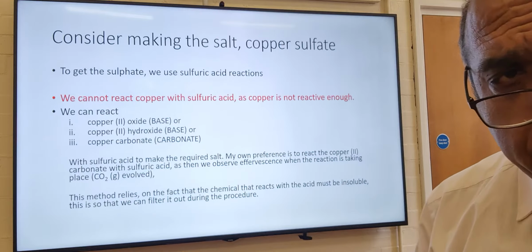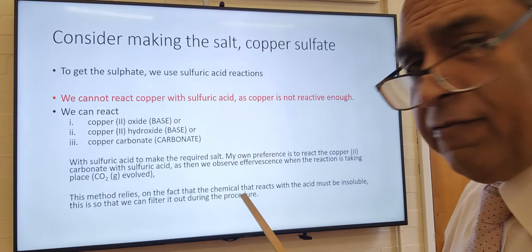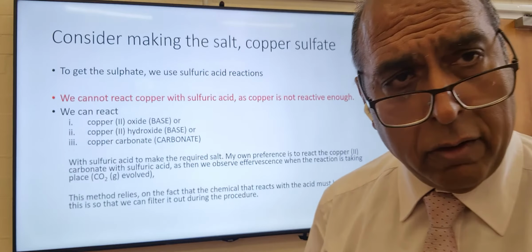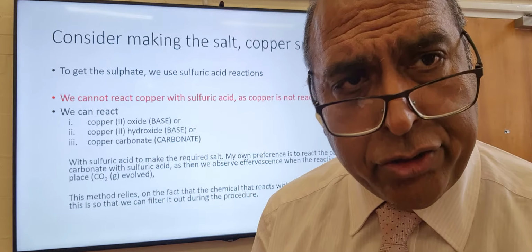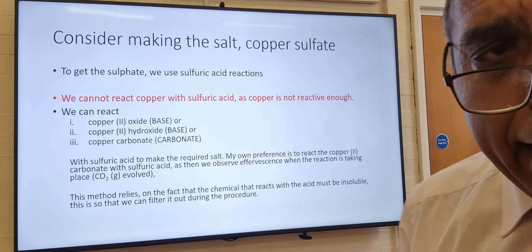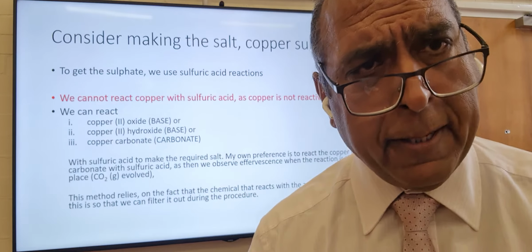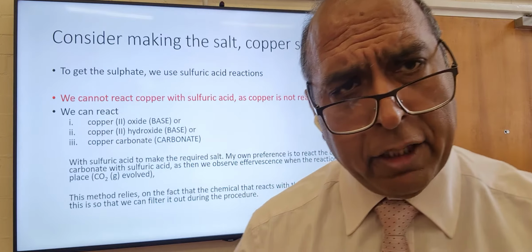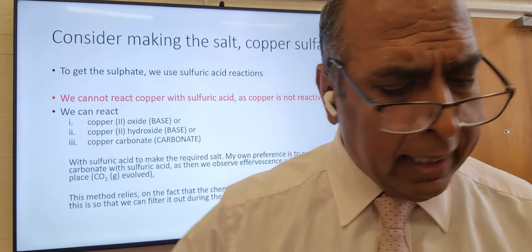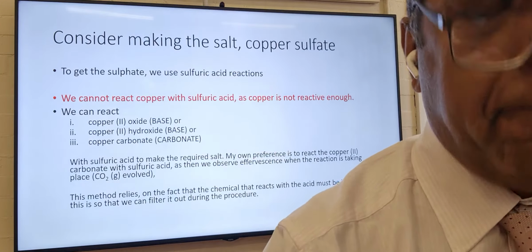The other thing I want you to be clear about is this method relies upon the fact that the chemicals you're reacting with the acid are not soluble, because the extra chemicals we are going to be filtering out. And if they were soluble, they would mess up our salt, introduce impurities, go through the filter paper, etc. I'll talk you through the exact method later, but let me have a look at the chemicals and show you the chemicals we're talking about.